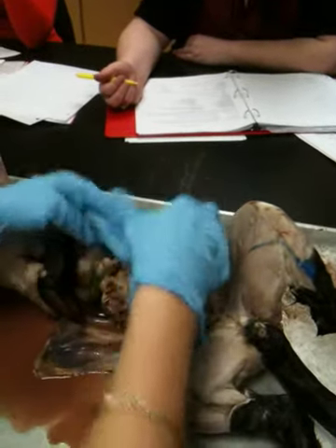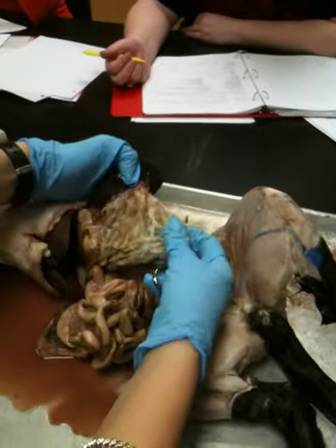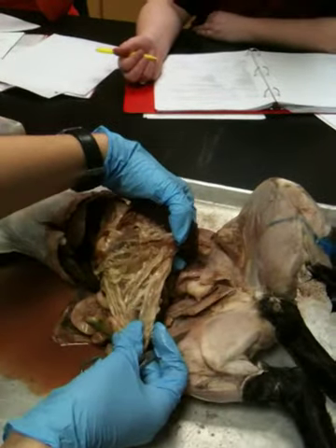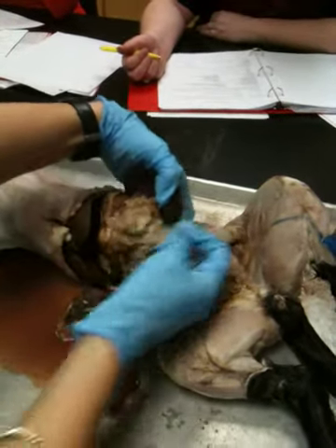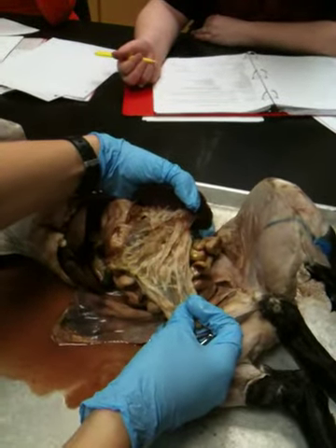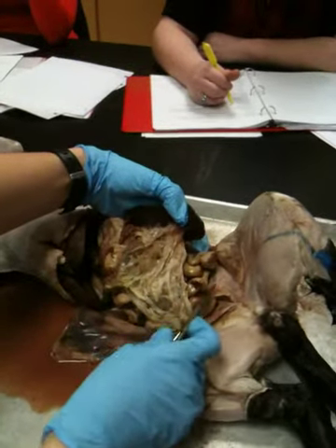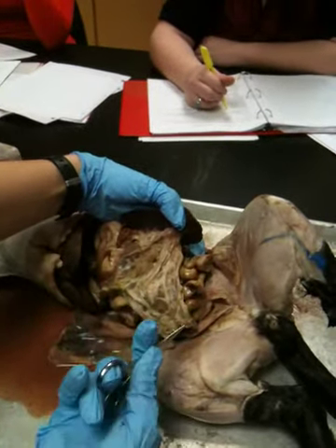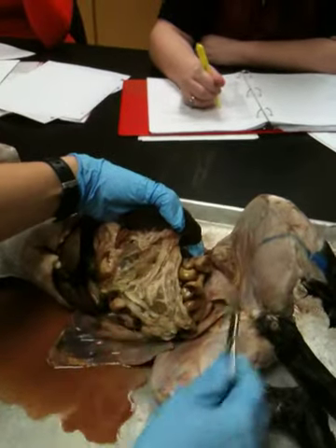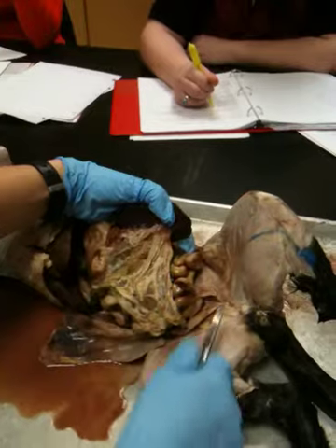Then there's a couple membranes. This big fat apron, this would actually lay over the entire top of the intestinal tract. If you had them all put in there, it would lay like this. And this is called the greater omentum. It has your lymph nodes and your fat, and that's like what's going to protect you because you don't have any bones over here. So if somebody punched you in the gut, you need a little bit of a cushion. So that's what your fat is. And it's also part of your beer belly. So if you got a little extra around there, you got more in there than you need.